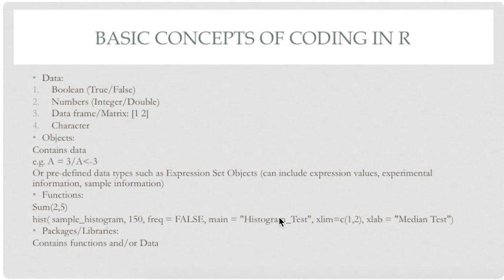And finally, we have packages or libraries, which contain custom functions or data. And a lot of the functions we'll be using today are custom functions, so you do have to import the relevant libraries before getting access to them. Or a library might contain data, and in today's example, it might contain annotation data, mapping probes in the microarray to genes.